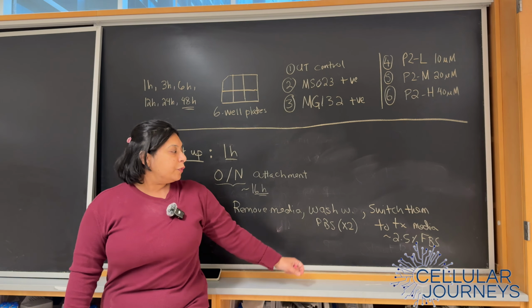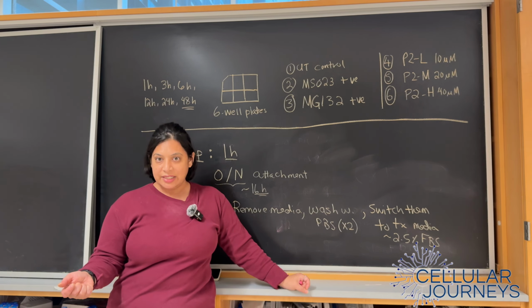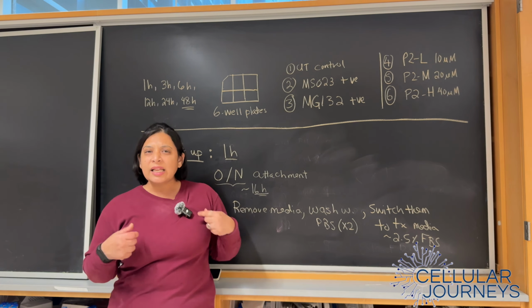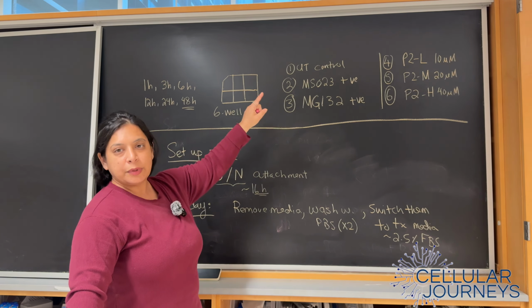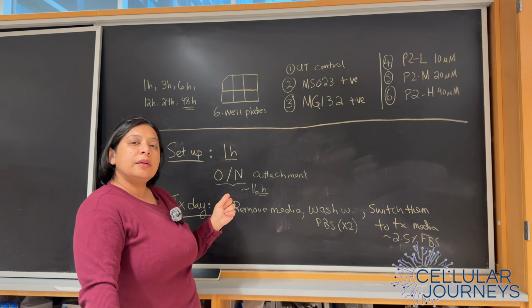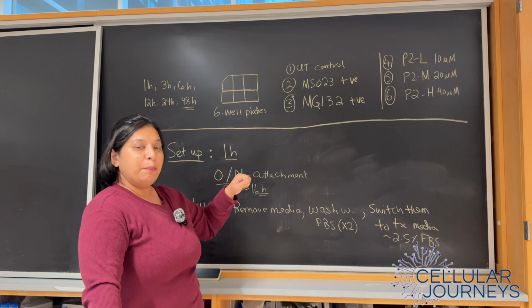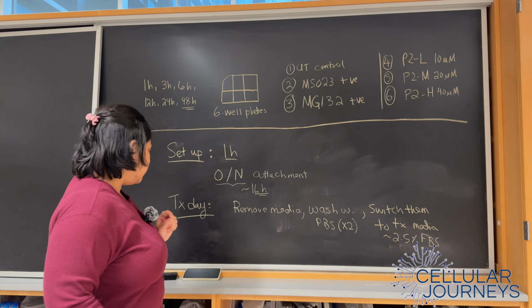We don't want to make it serum free, because one of the effects is autophagy. And just not having serum can trigger autophagy as well. So we want to keep it where there's a little bit there to keep the things in control, and then we are going to be able to look at the effect of our drug more specifically. If we were interested in proteins that were secreted by the cells, those proteins would have to be collected in the media, in which case we would have to go to serum free. But in this case, we don't need to worry about that.